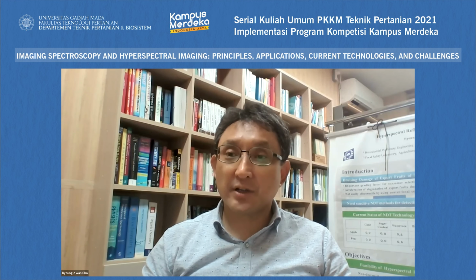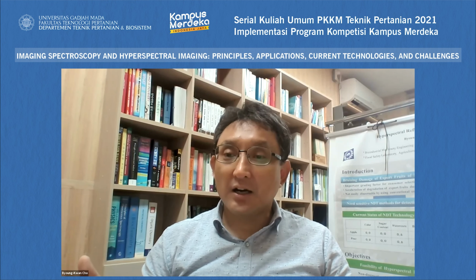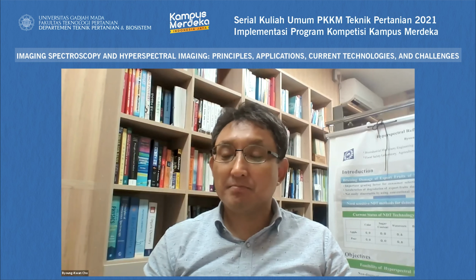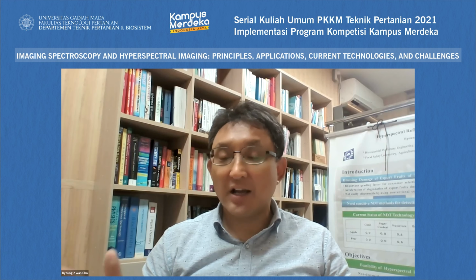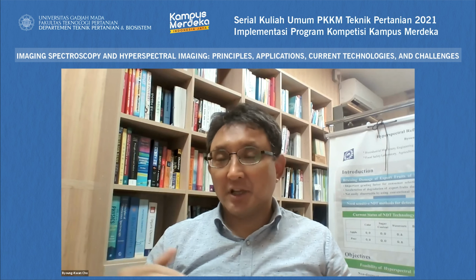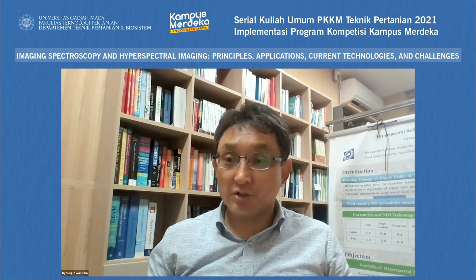Okay, so hyperspectral imaging is also like a spectroscopic technology, but it depends on the system specs, because some hyperspectral systems have higher spectral resolution, but some economic systems have lower resolution.